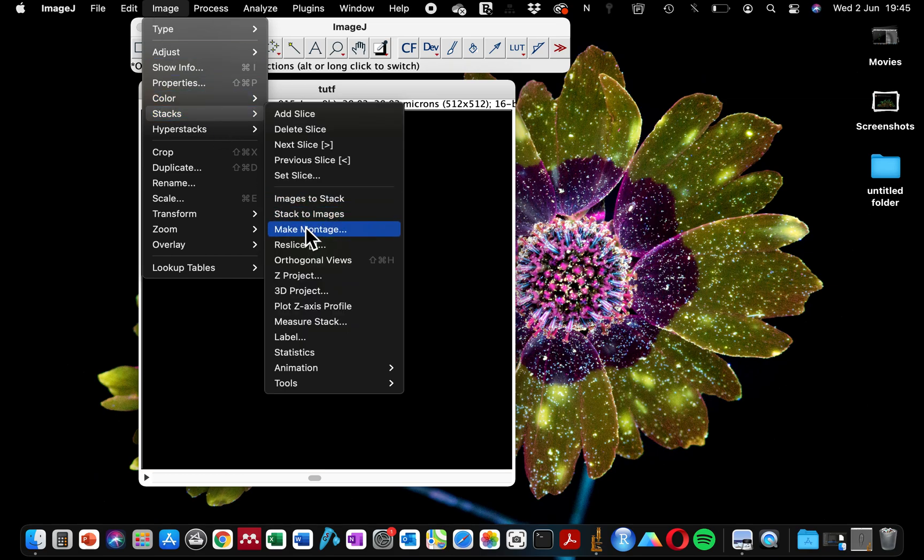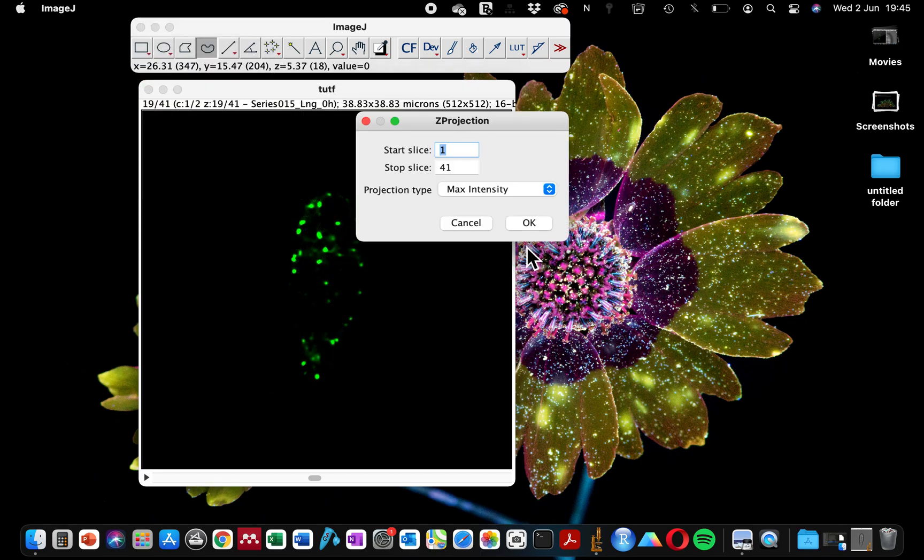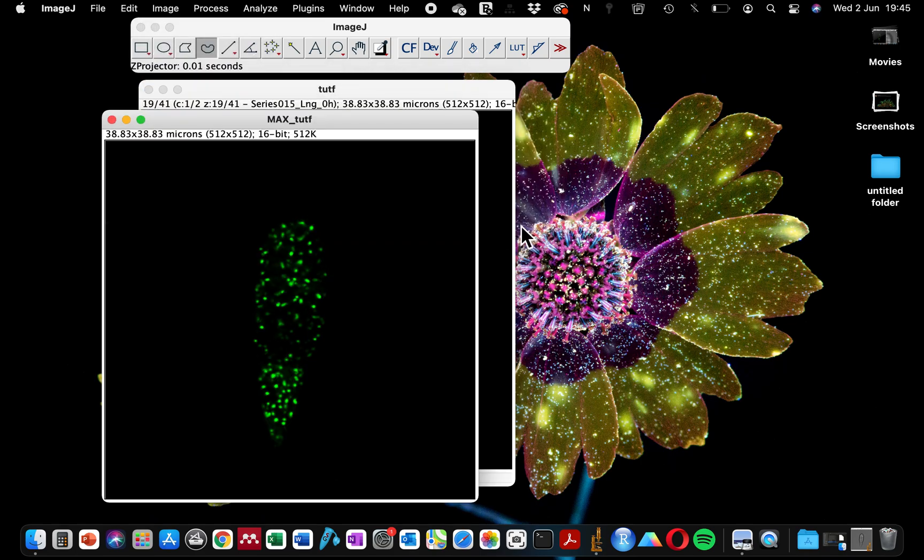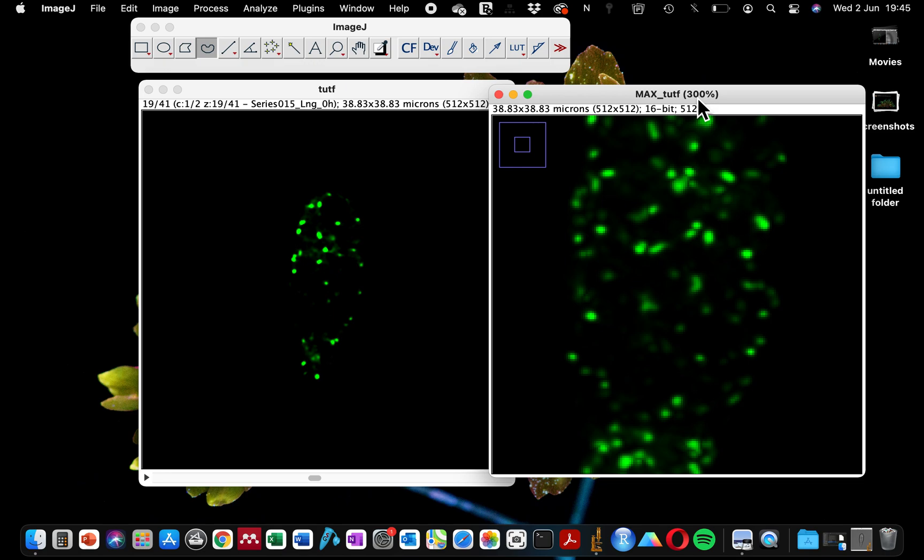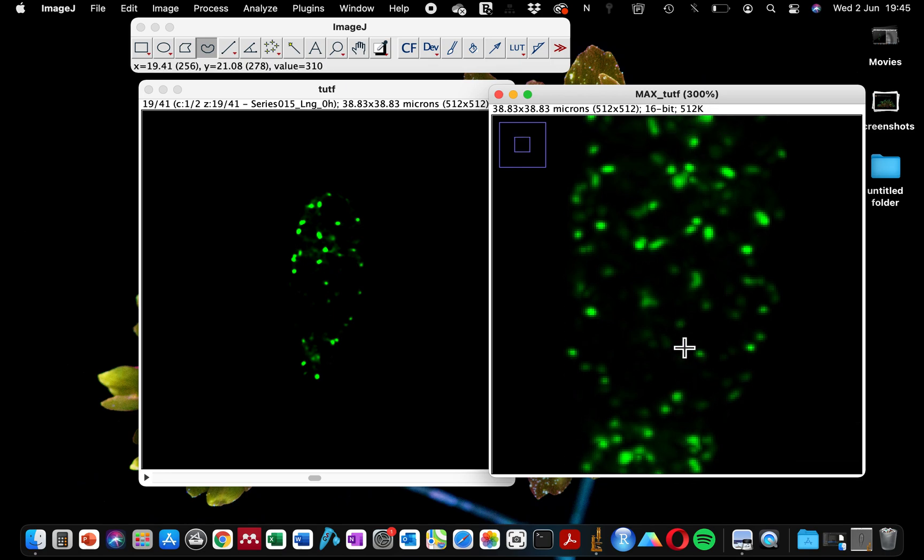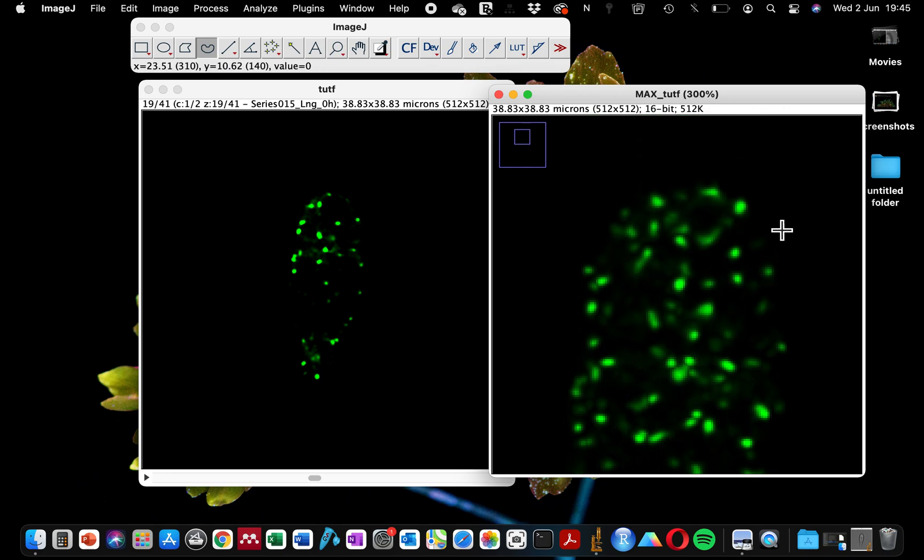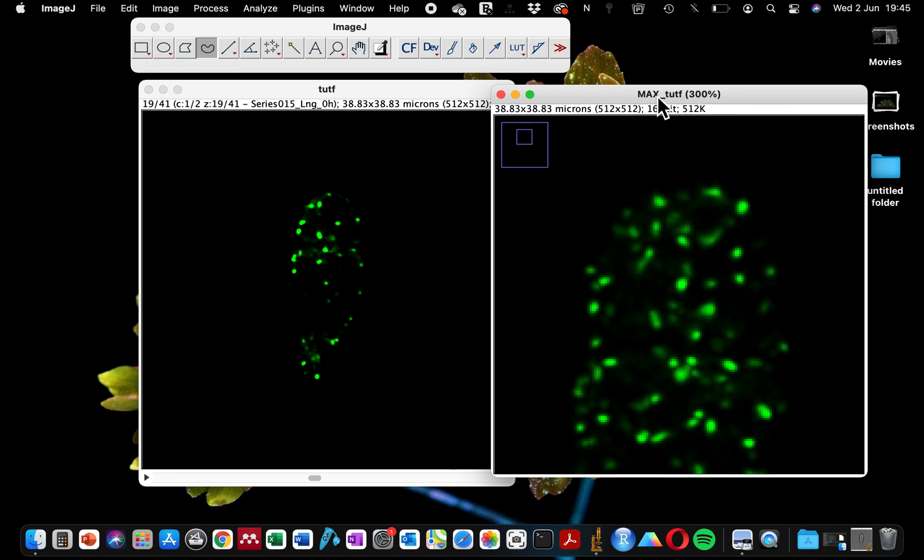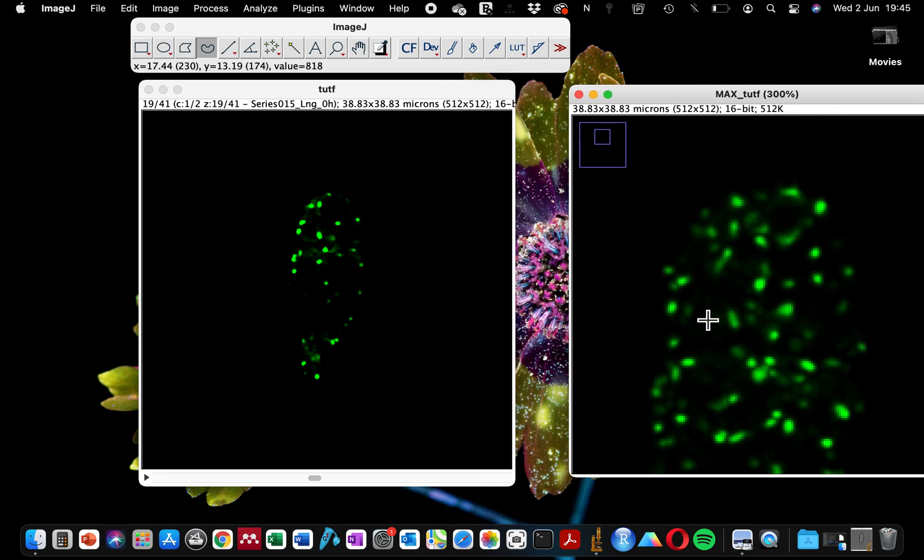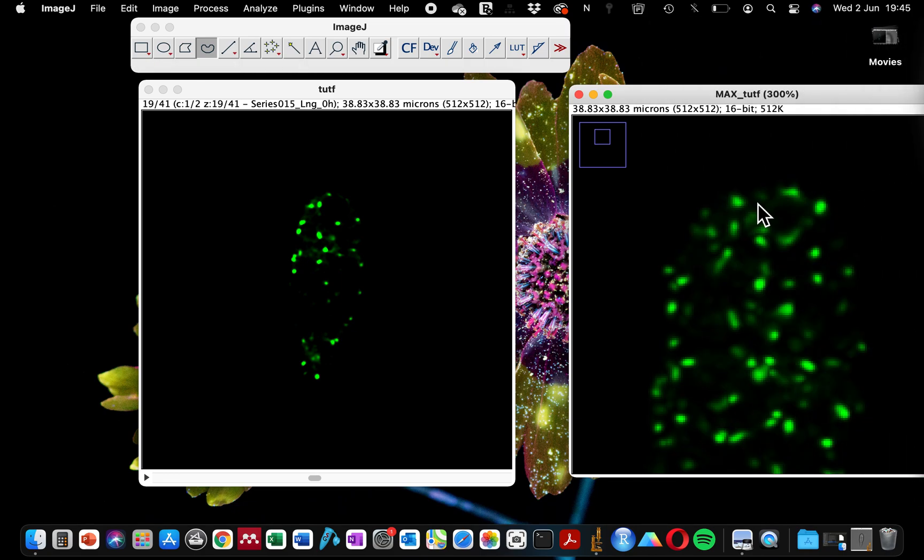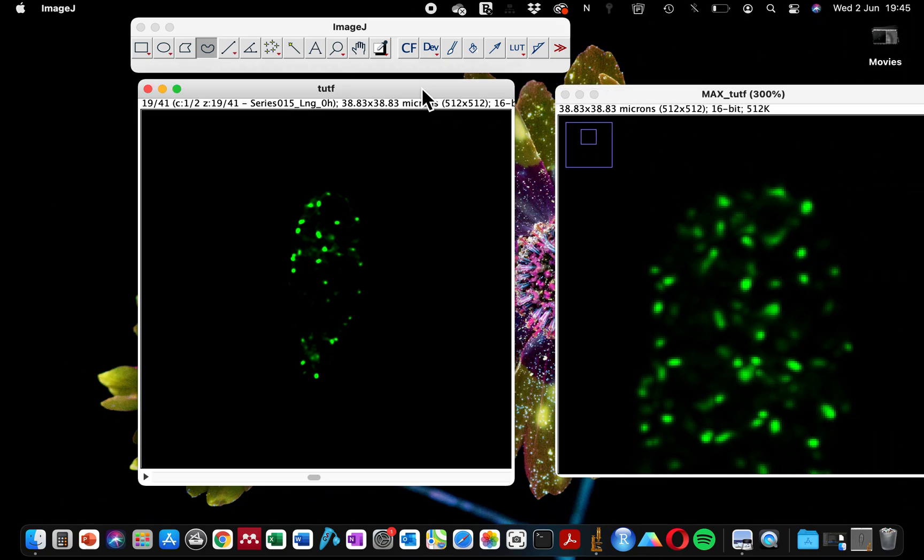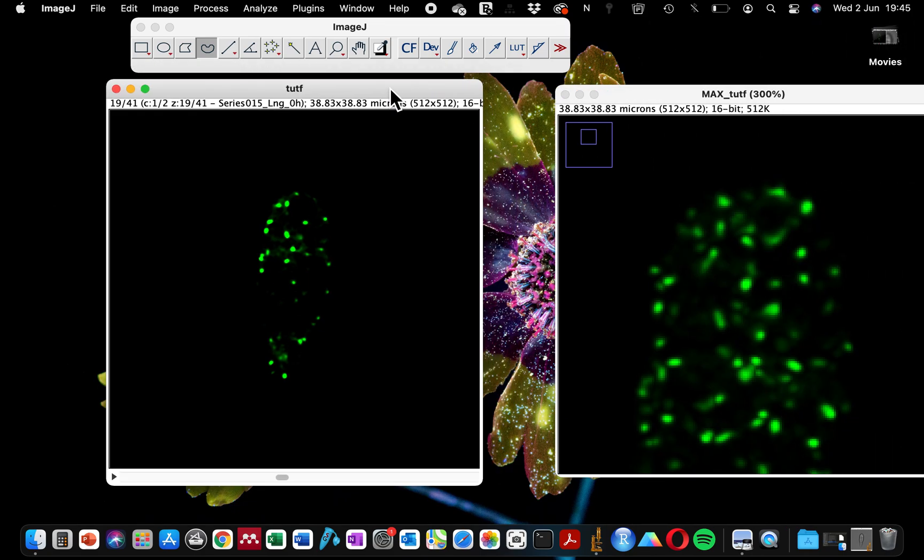Normally what we do in order to show the sample is putting it into a maximum projection, which will just show all objects in a 2D representation. You can see these are my objects projected into a 2D format.